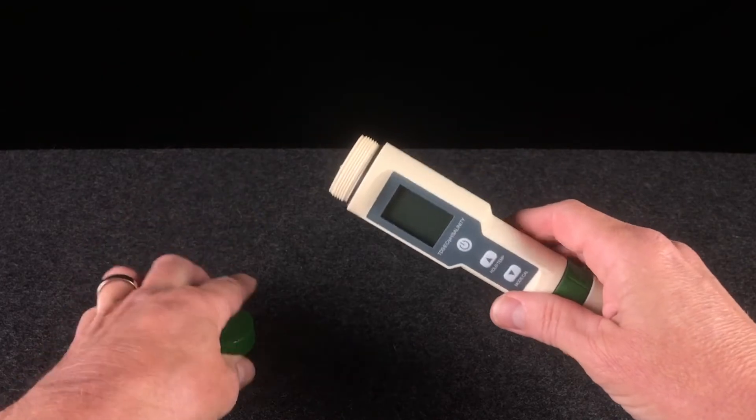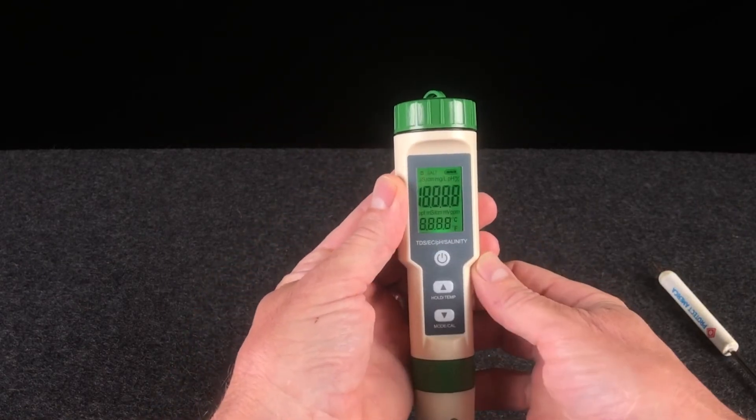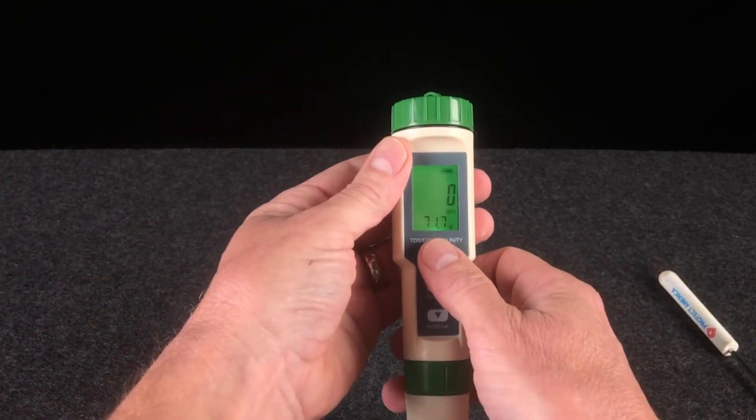Place them in the unit and replace the cap, then test the meter. They should be fine, but if they're not, simply remove the cap, switch the batteries in the other direction, and try it again.